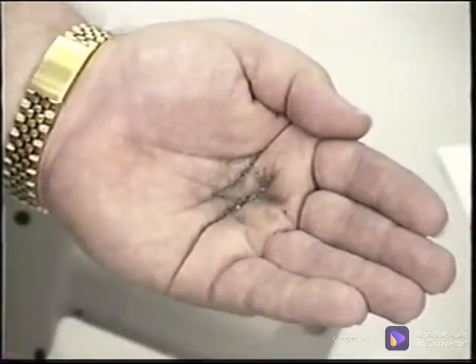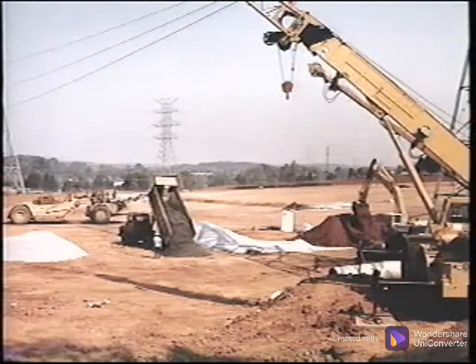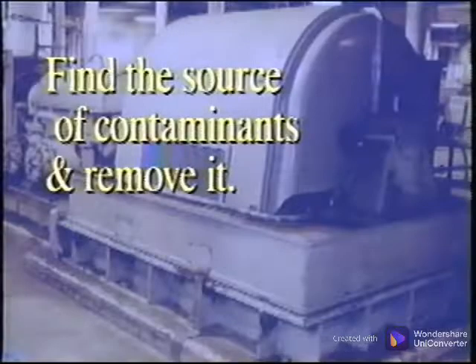The most common contaminant is silica, which is sand or dirt, and its crystalline structure is much harder than machinery components, even carbon steel. It is 3 times harder than the case-hardened surface of the races of a rolling element bearing. Since 2/3 of the Earth's crust is covered with silica, it is a very likely contaminant which can enter the system through the breather of the oil sump. When silica is present, wear particles are usually present also.